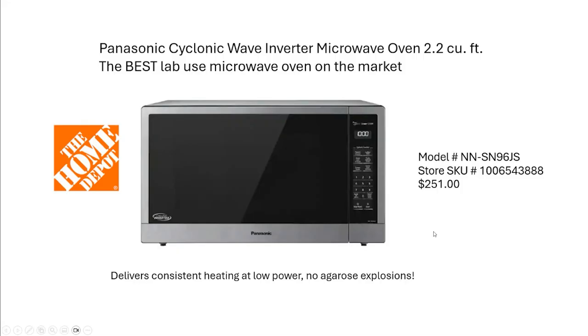So you will boil your agar, for a mouse, let's say you did 30 mils of agar with 1.6% agarose. You'd have to boil multiple times to make sure that all the particulates inside are completely dissolved. If you are not thorough about the dissolution of the particulates in the agar, small pieces will clog up the airways, and you will have a difficult time inflating your lung.